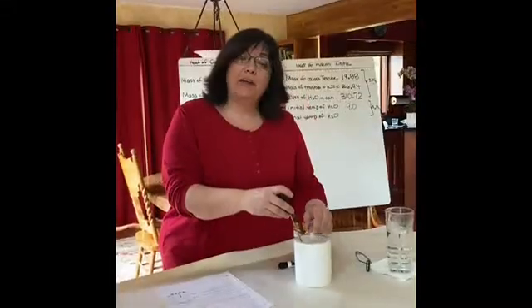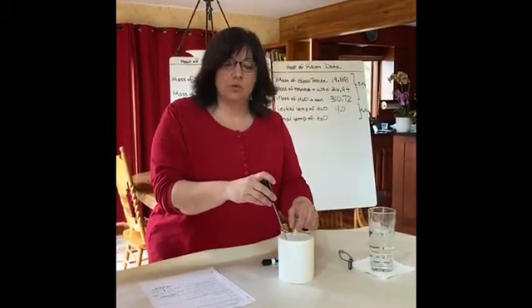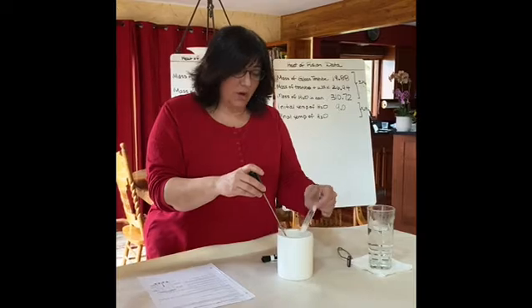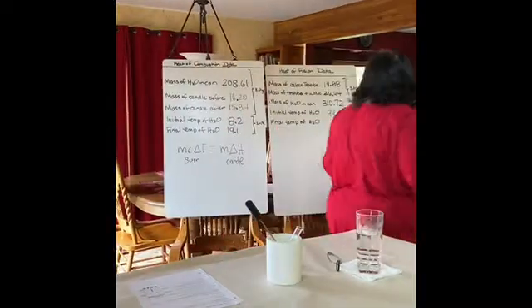So we are back for the last time. The test tube with the wax has been in the cold water cooling and pretty well stabilized at this point. So we are going to call this final temp as 11.4 degrees Celsius.